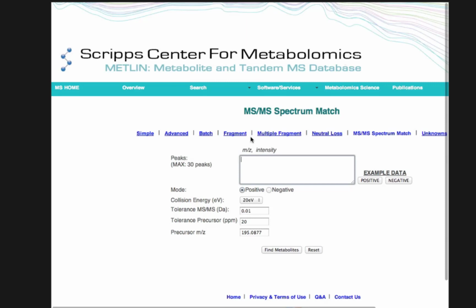So you see different types of metabolites, and our search engine needs to generate these ions because in the database, we actually don't have the masses that we're looking for. We have the structures, and the organic structures are typically uncharged. So if you select negative or positive mode, there are different ways in which they can be ionized, for example, by adding a proton or by adding an electron, and that has an impact on the mass. And then you search them.